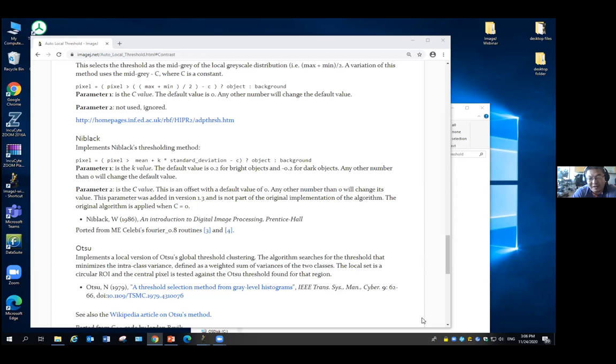If you can get a crystal clear image with no noise, that will be the best. So if you see any problem in your image analysis, your first thought is not how do I improve it on the image analysis part, but how I can get a better image, then put it into ImageJ.